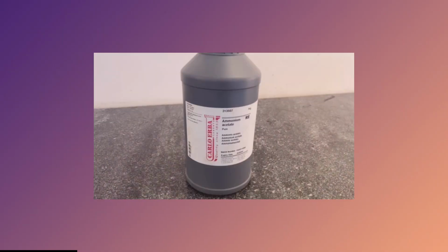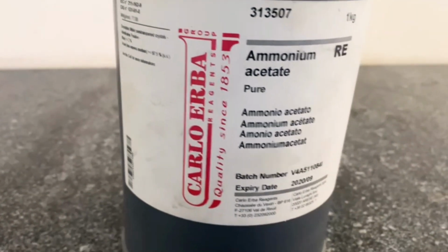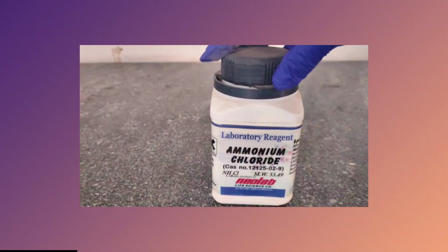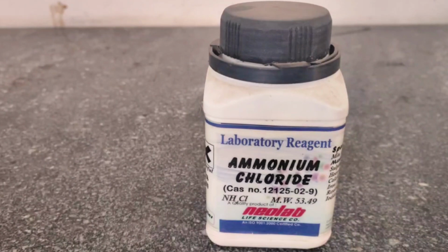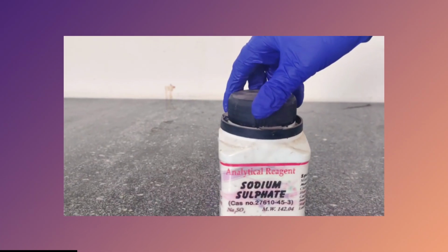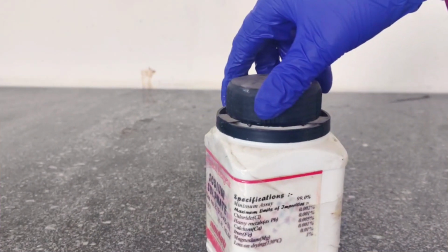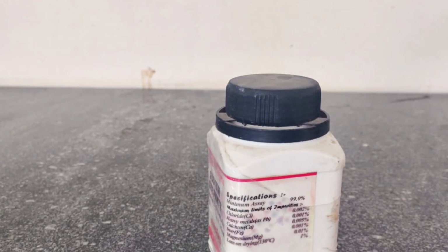3. Salts. Ammonium acetate can be replaced by sodium acetate in buffer solutions, but the concentration should be similar to ensure effective buffering. Ammonium chloride could be swapped with sodium chloride for similar uses in preparing ammonia-based solutions and buffer systems, though the exact concentration may need to be adjusted. Sodium sulfate used as a drying agent can be replaced with magnesium sulfate or calcium sulfate, though ensure that the drying capacity is similar by adjusting the quantity based on their purity and concentration.